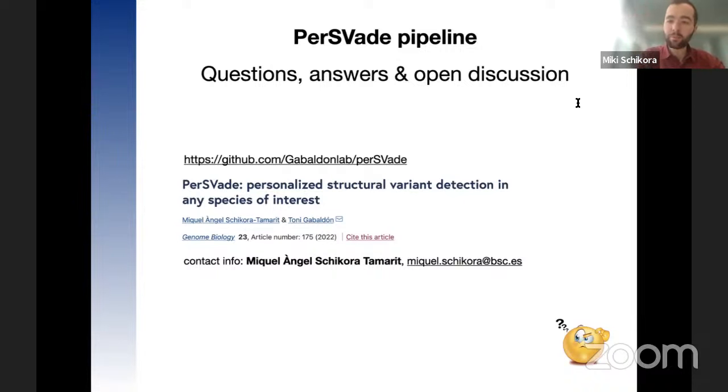So it really impacts. Now, as for medium coverage, I think the Drosophila one was around 5x, and you would see a drop. But for 10x in some species, we saw that, at least in the simulations, we could find quite accurate variants. But again, you can check these with the pipeline. That's the point. You can run this optimization yourself with your specific data set, and you can find out.